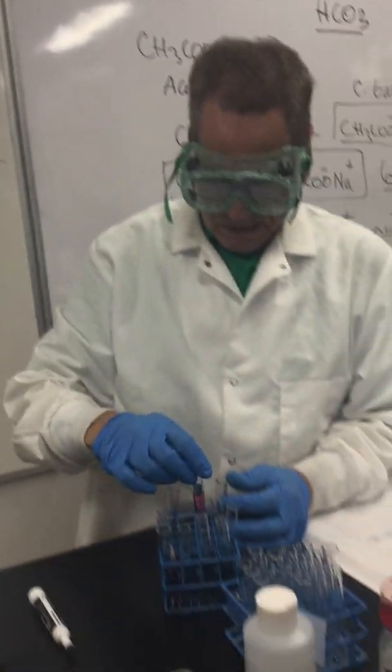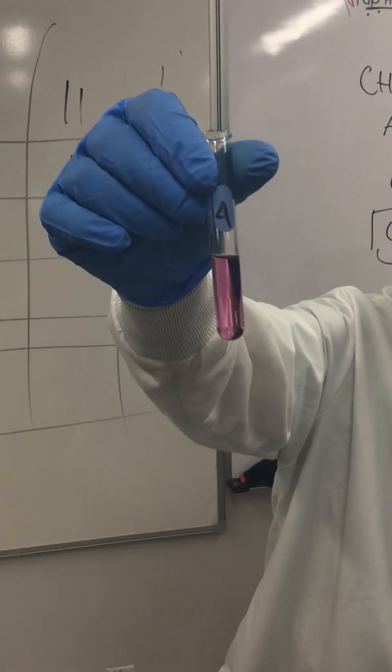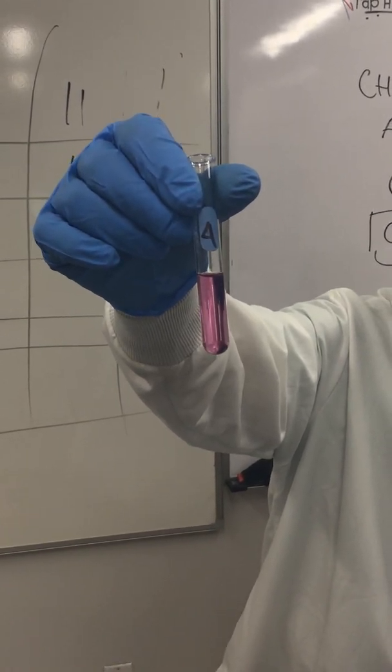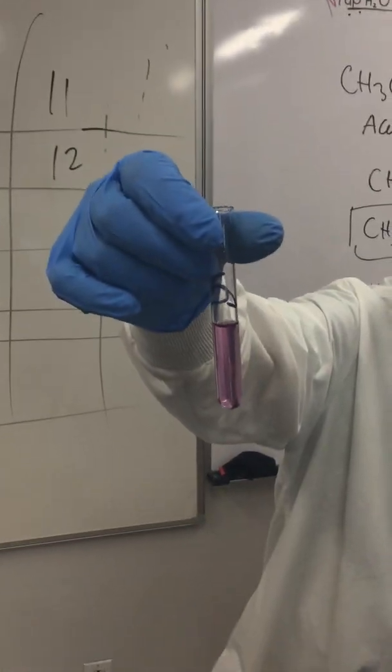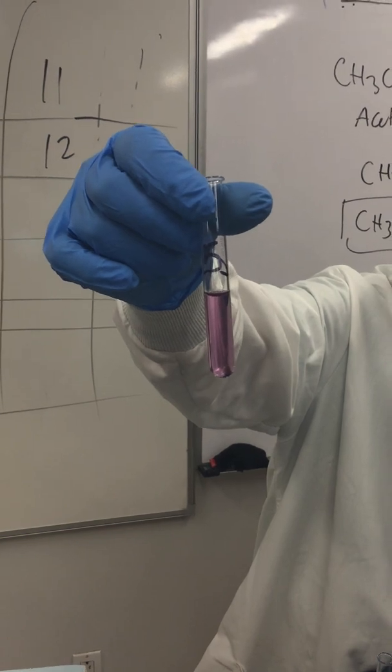Then we have pH 4, and pH 5, where it started out pink and is now changing color a little bit.